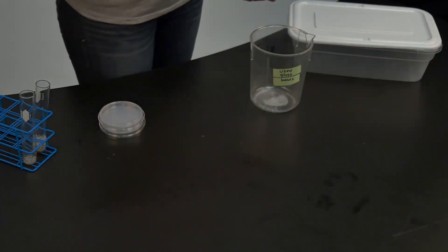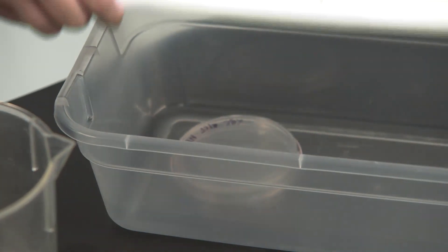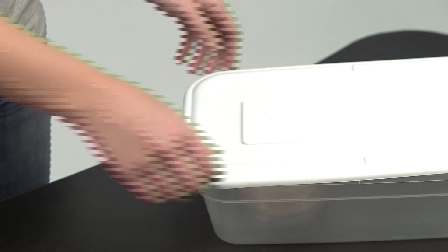Turn each of your plates upside down with the lid on the bottom and store them in your plastic storage container. The purpose for turning it upside down is to prevent the condensation on the lid of the plate from falling onto the agar where your bacteria are growing.